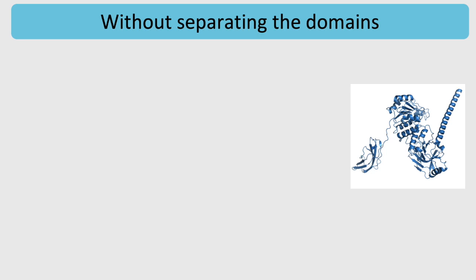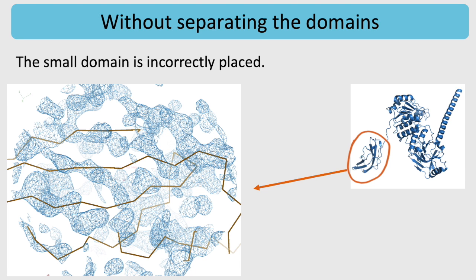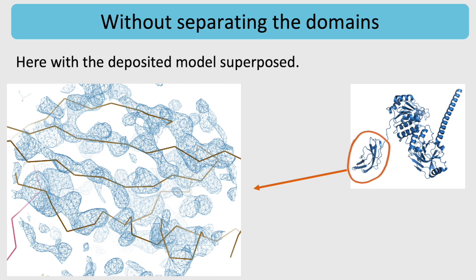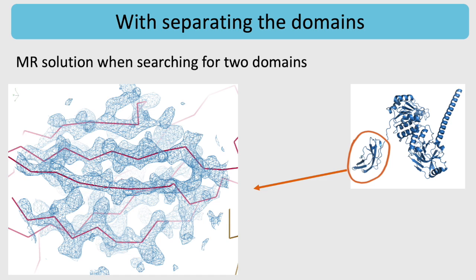If we don't break the model into domains and use instead the AlphaFold model as is, then Phaser can still find a solution in this case. However, the small domain is not well placed, as can be seen in this screenshot. The residues do not fit the density. When we overlay the deposited model from the PDB, we see that the orientation of the small domain is different. To fix this, significant manual work or rebuilding is needed. In contrast, when we search for two domains, the residues fit the density very well.